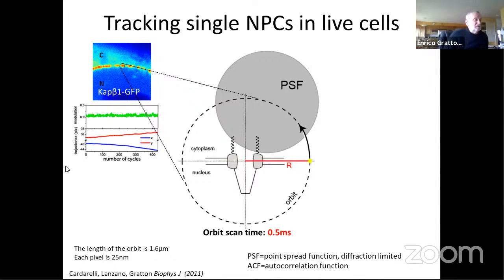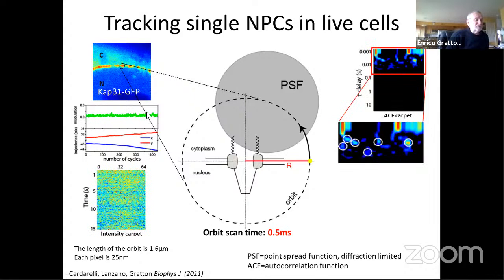Okay. So this indicates that we track, so the X and the Y move, but the modulation stays constant, and that simply says that we can track it.